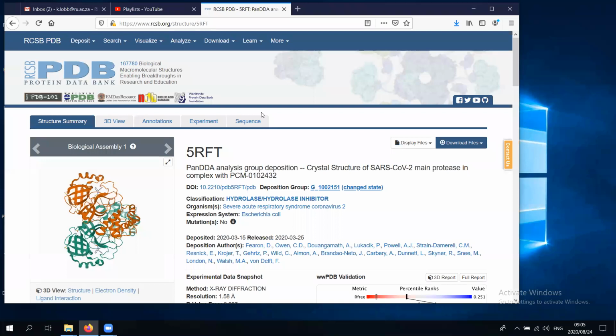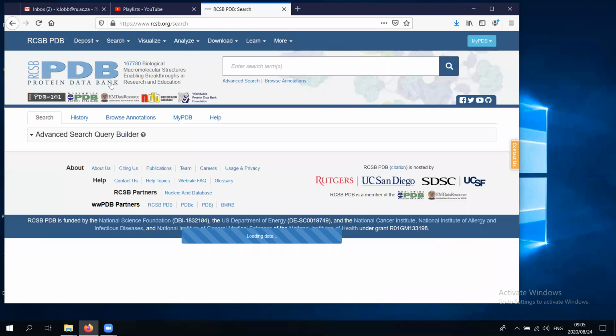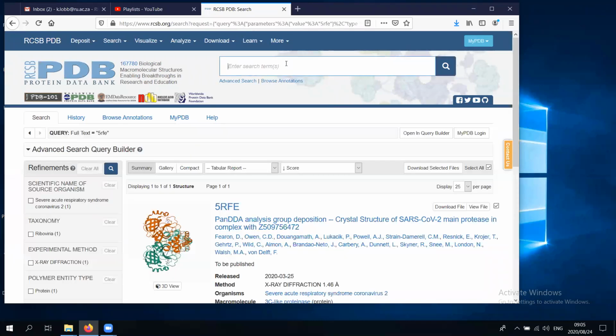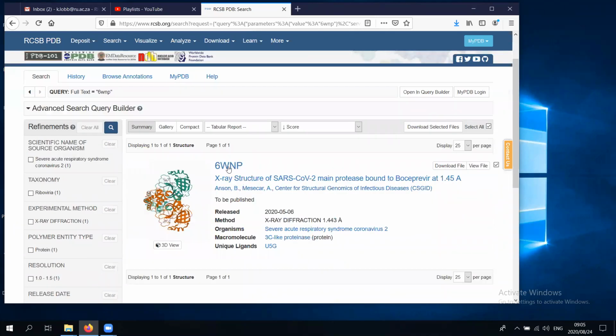Now, what I've asked you to look at is like a worst case scenario. These are receptors that have got multiple conformations in them. If you're looking at different receptors, you might not have multiple conformations. And so this is the last one. You might not have to do all the steps that I have to do of copying to the cluster to extract just one conformation. But really, I want you to be able to work with the worst case receptor that gets thrown at you.